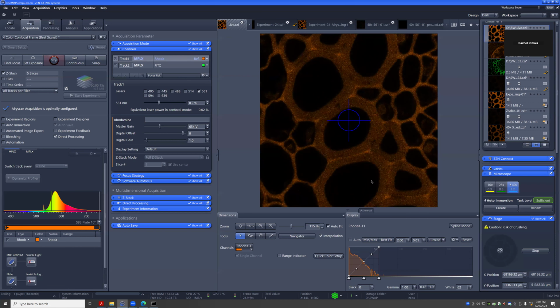The same thing you can do with the time lapse. It'll generate that raw data, and you could look at the time points before they're processed. So that's one way to check. Because if you don't see signal here, the processed image also is not going to have anything, right? You cannot turn nothing into something. There's no microscopy magic, right? You have to have some light information to get a super resolution image.